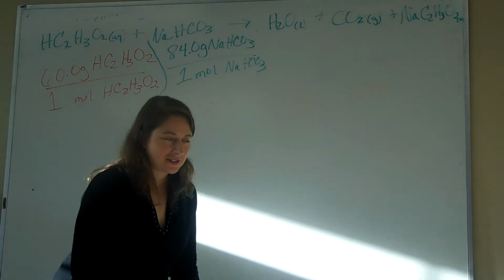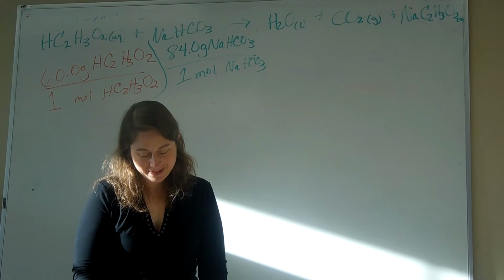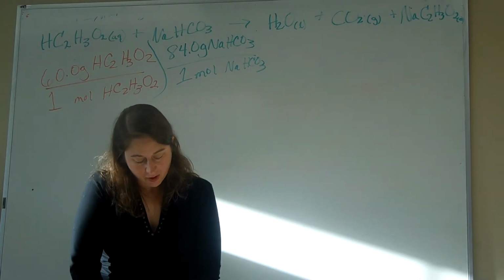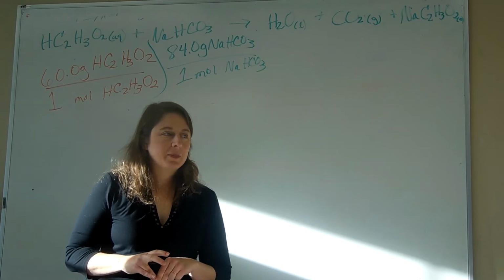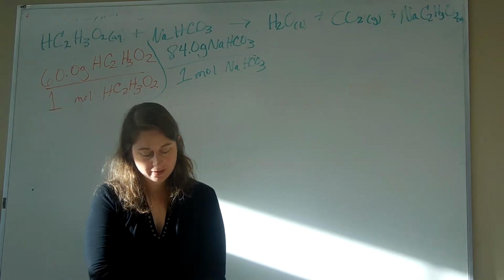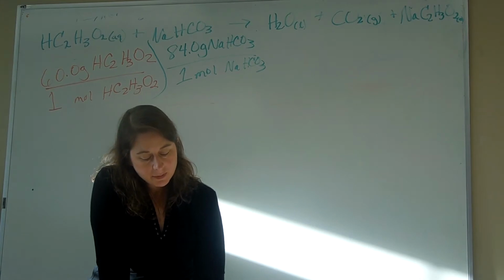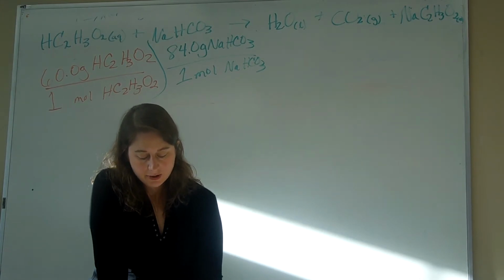We don't have to repeat this experiment. If we take our measurements today, we can just do the math later and not make a mess again. So, here's the difficult part, the part that you wouldn't necessarily be expected to do on your own. Number 4 says vinegar is a 5% acetic acid solution in water.